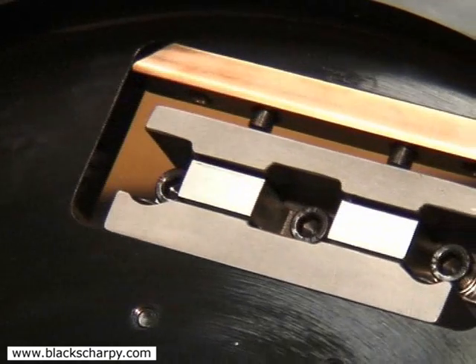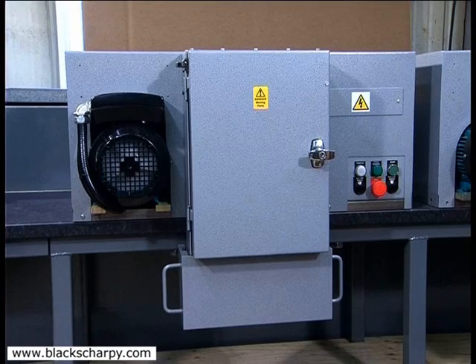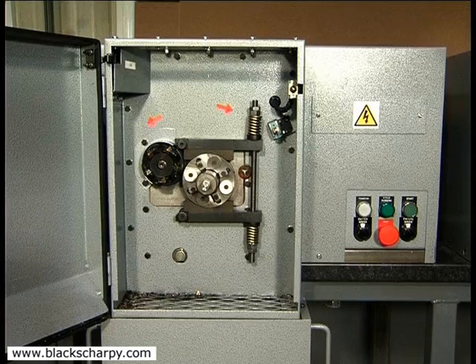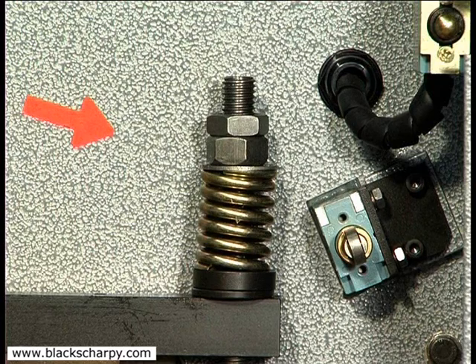Our Charpy and Izod specimen machine is of compact design and enables test houses and laboratories to manufacture their own 10 millimeter square Charpy and Izod samples without having to rely on functions outside their own control, such as machine shops.